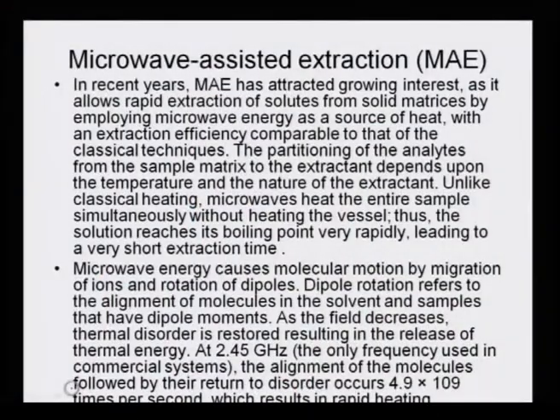Microwave energy causes molecular motion by migration of ions and rotation of dipoles. The dipolar rotation refers to the alignment of molecules in the solvent, and samples that have dipole moments can only be heated in this system. As the field decreases, thermal disorder is restored, resulting in the release of thermal energy.